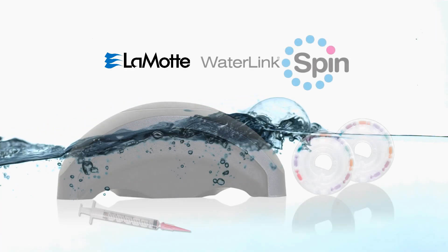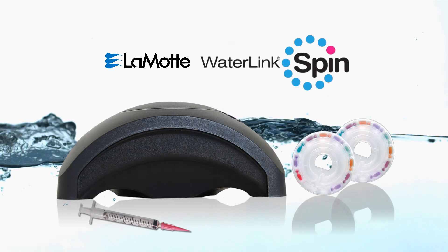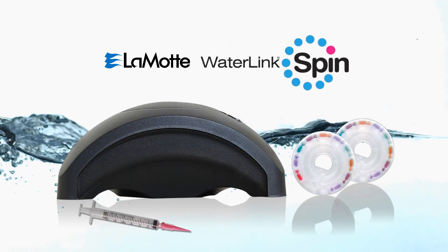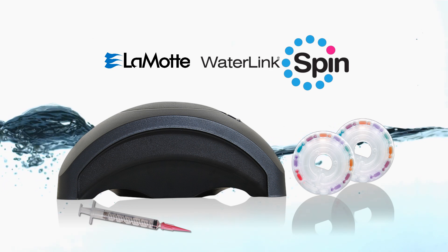The Lamott WaterLink SpinLab provides the ultimate water analysis solution, setting the new standard in precision and speed. Welcome to the revolution.